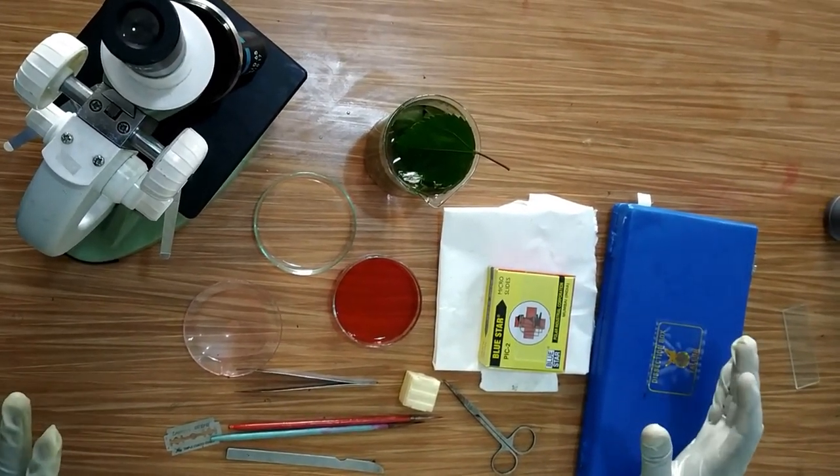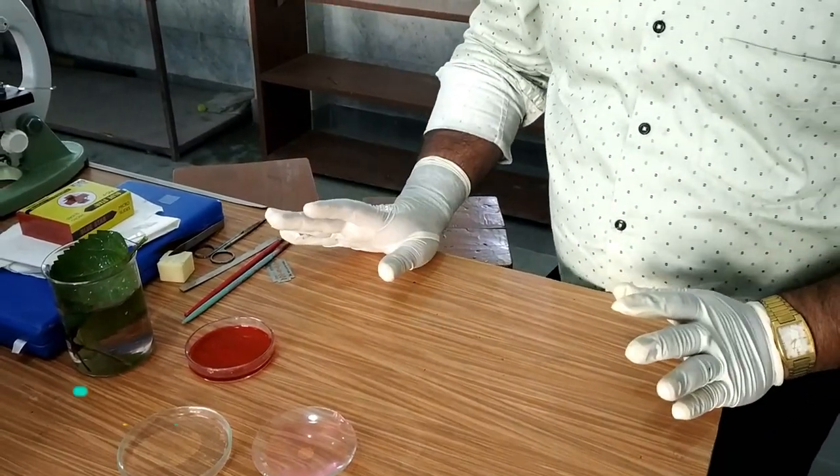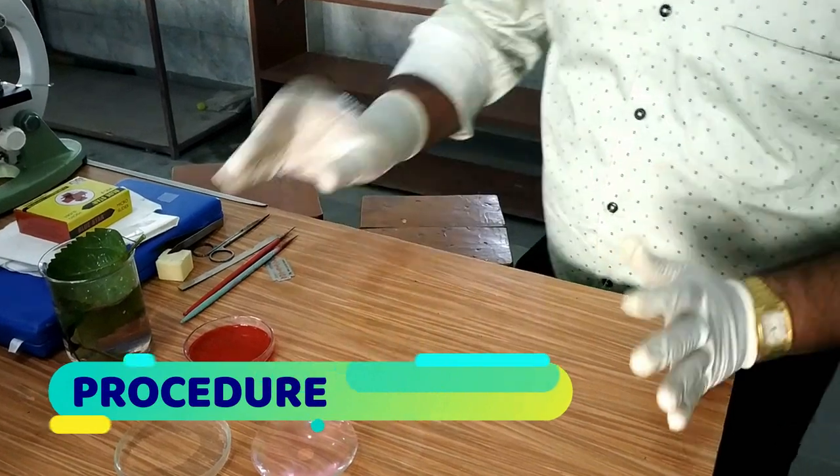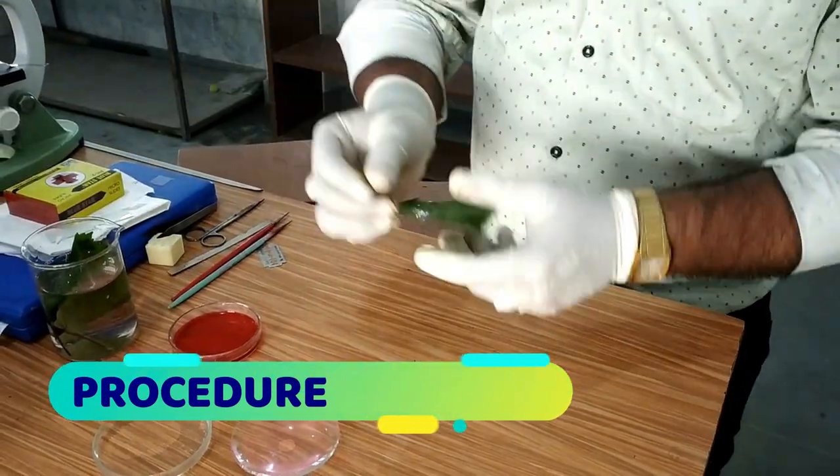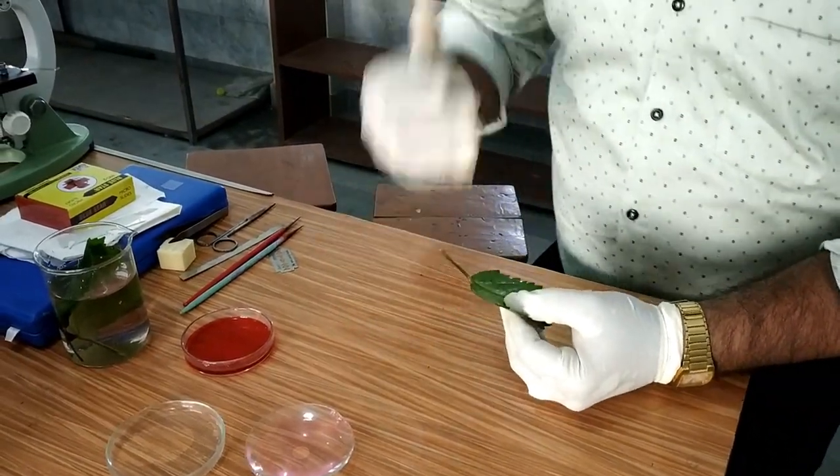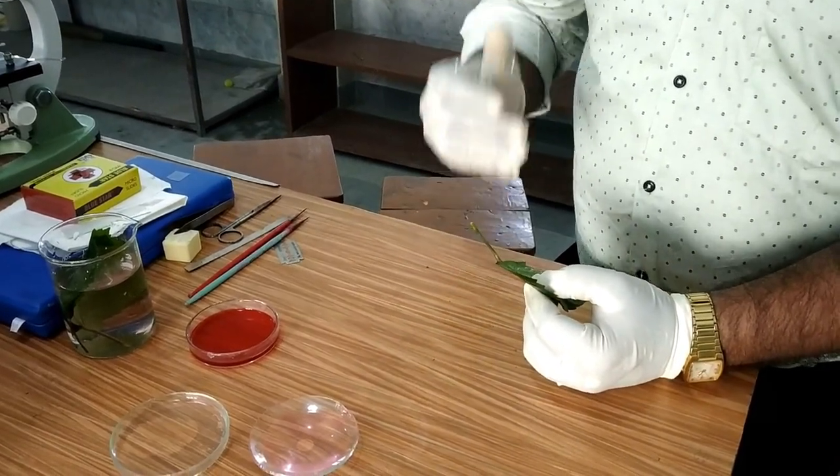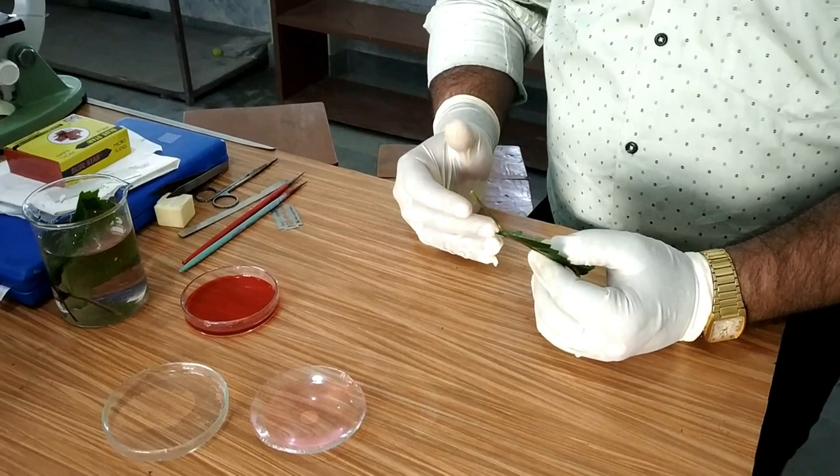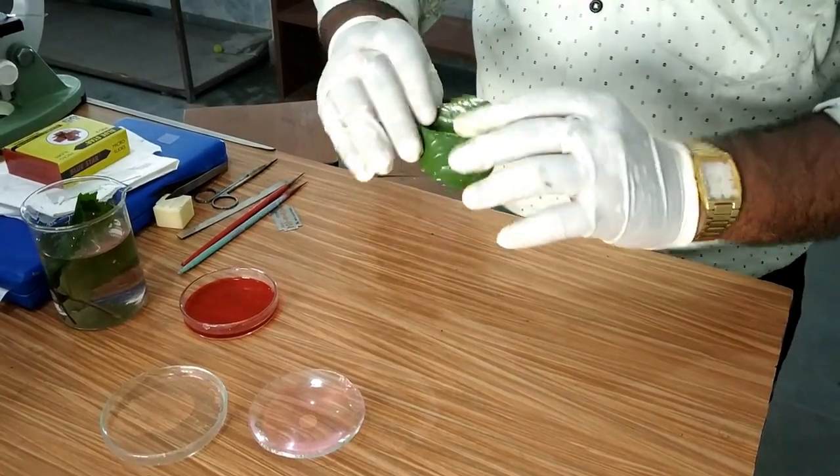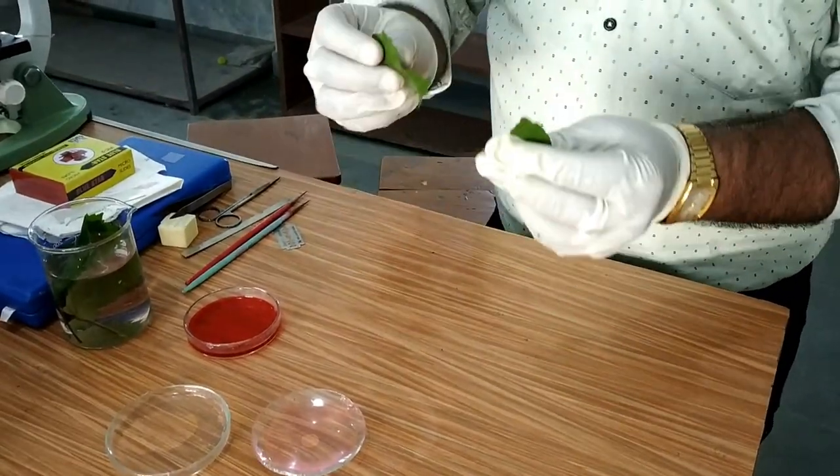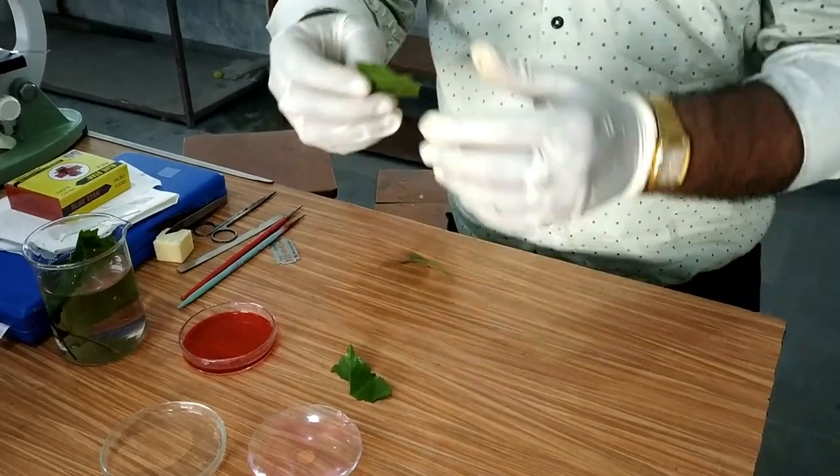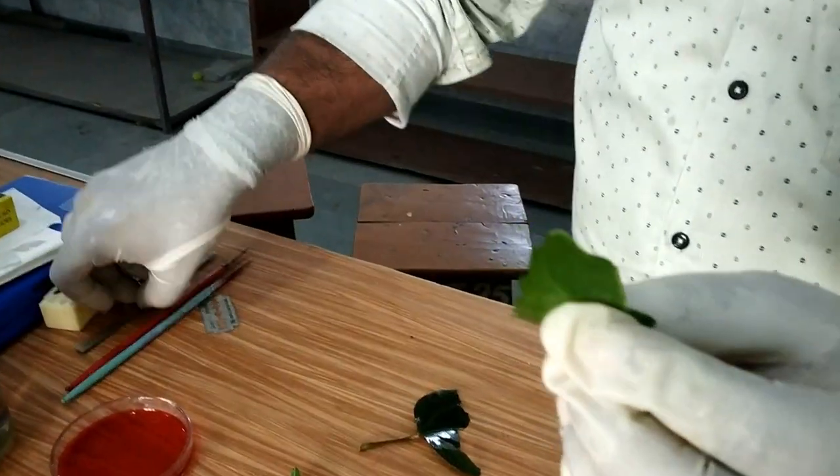We can perform this experiment by two methods. The first method: first of all, we need to take one leaf and then tear the leaf in the opposite direction of the vein formation. After tearing the leaf, here you can see I have got a transparent epidermal peel.